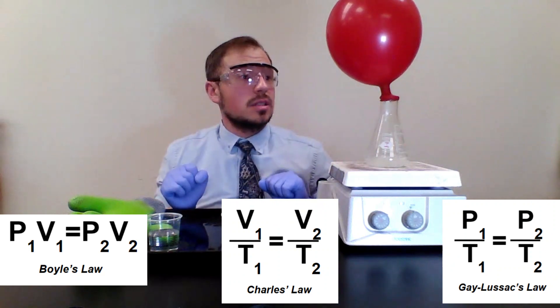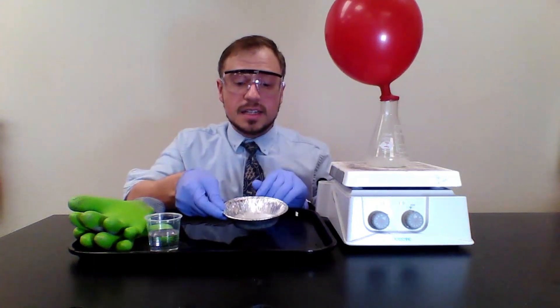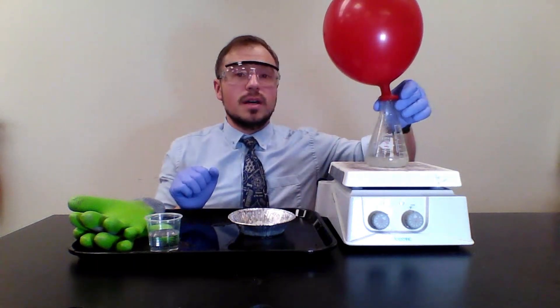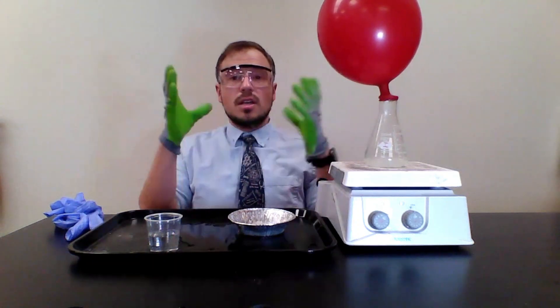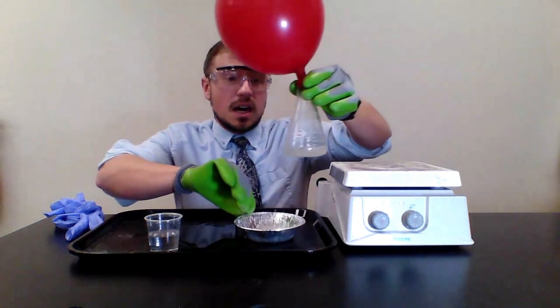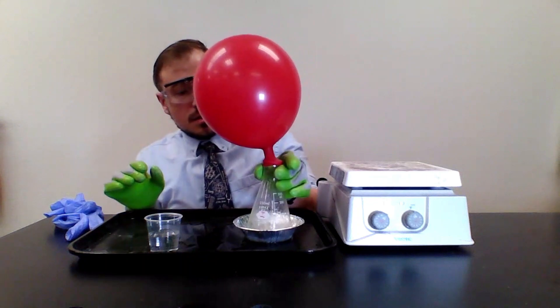Before the balloon gets too big, I'm going to place the Erlenmeyer flask in the ice bath to drop the temperature and see what happens to the balloon. I'll carefully take it off the hot plate — grabbing up at the top. I'll put on some thermal insulating gloves for safety; tongs work as well. Now placing it in the ice bath.